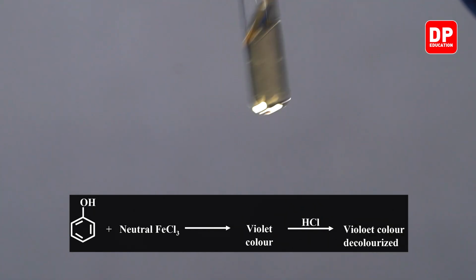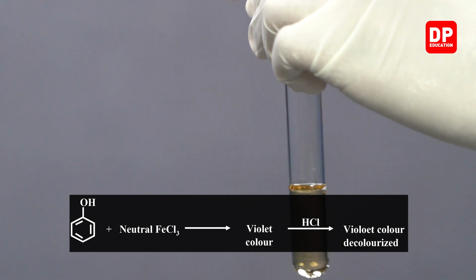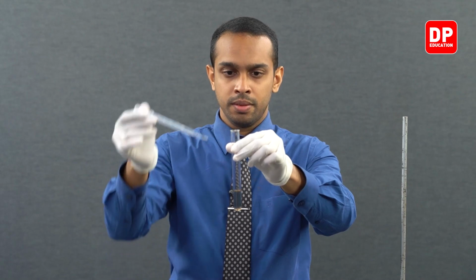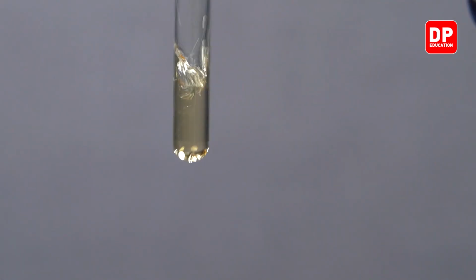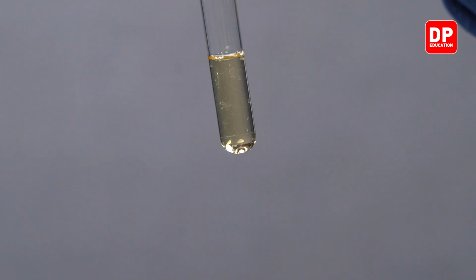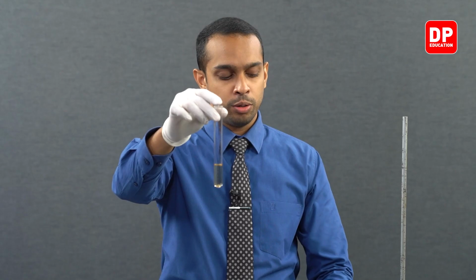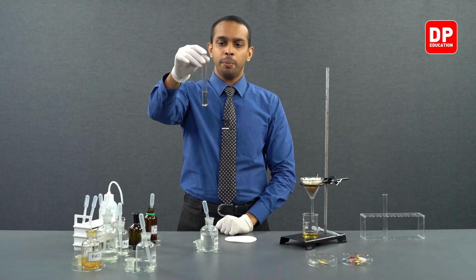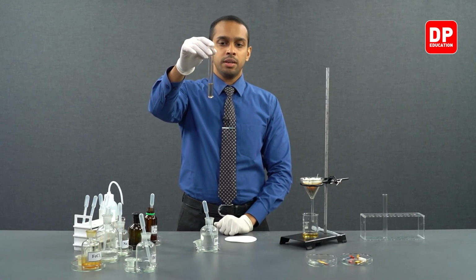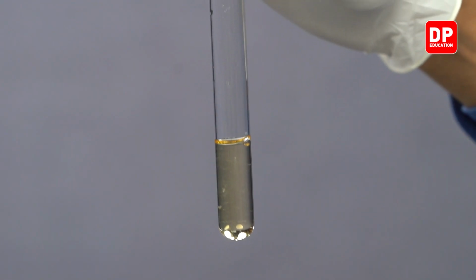The color of the solution is starting to disappear. And we are noticing the color that we had earlier. Initially, when we were starting this experiment, the ferric chloride neutral solution we took to our test tube had the same color, but when we reacted it with phenol, we saw the color turn to a purple or violet color.